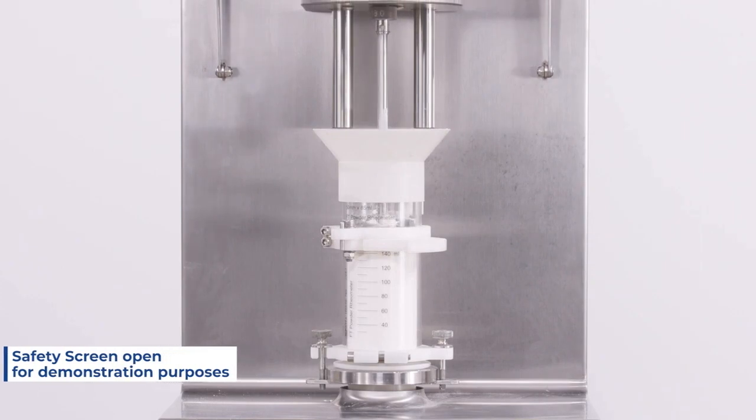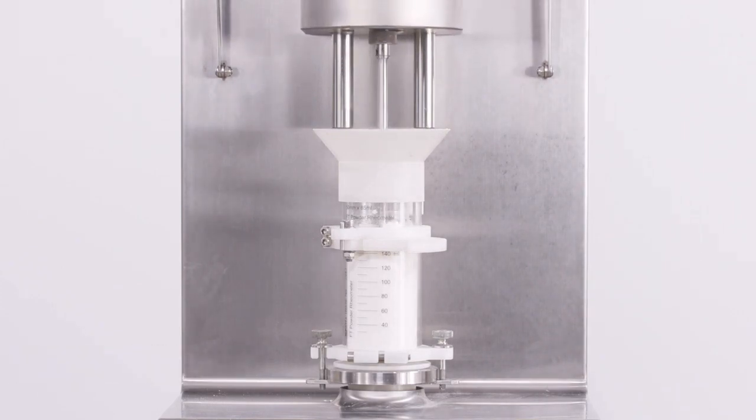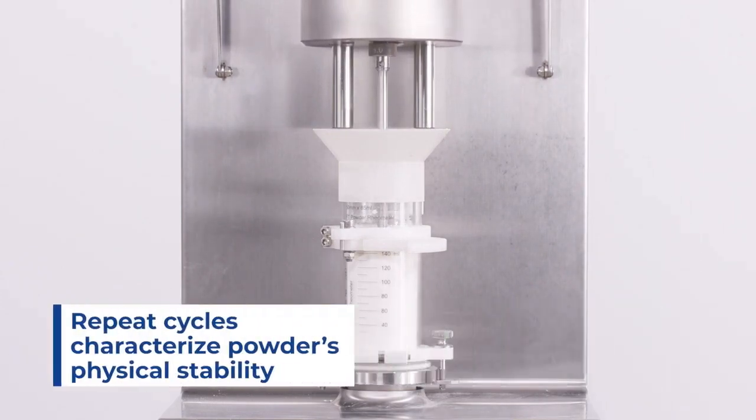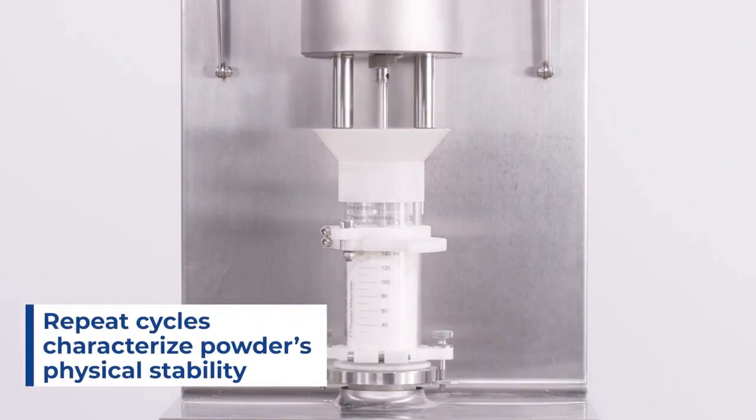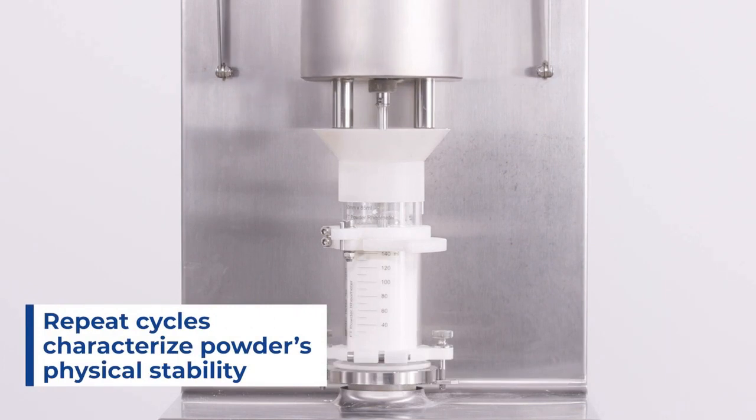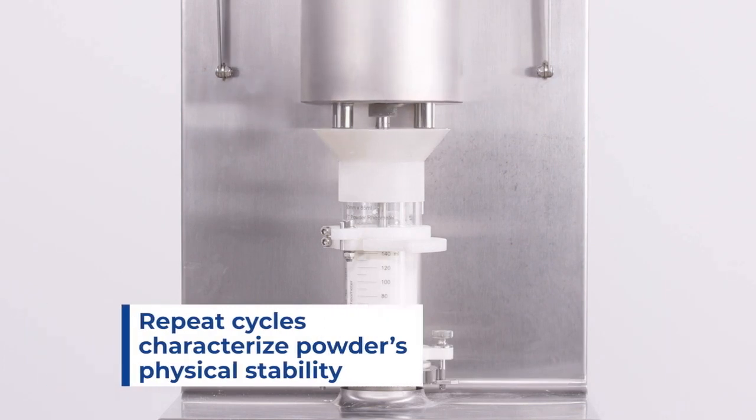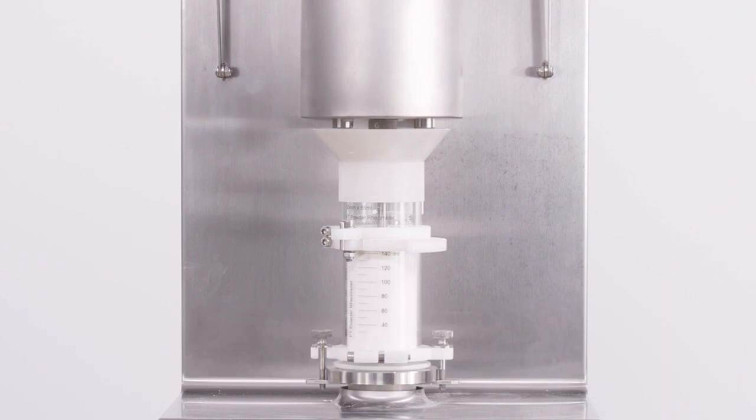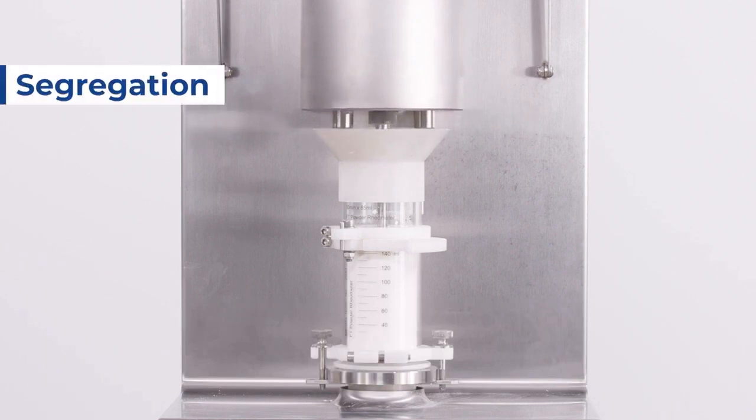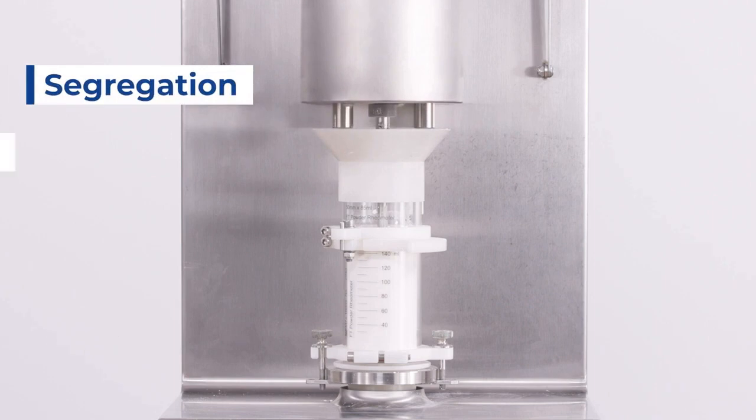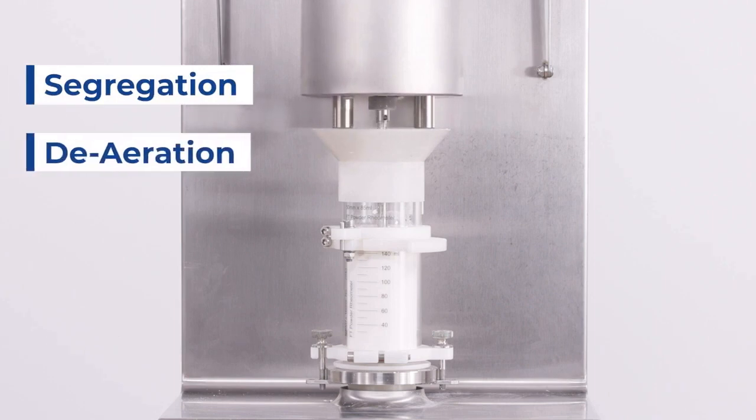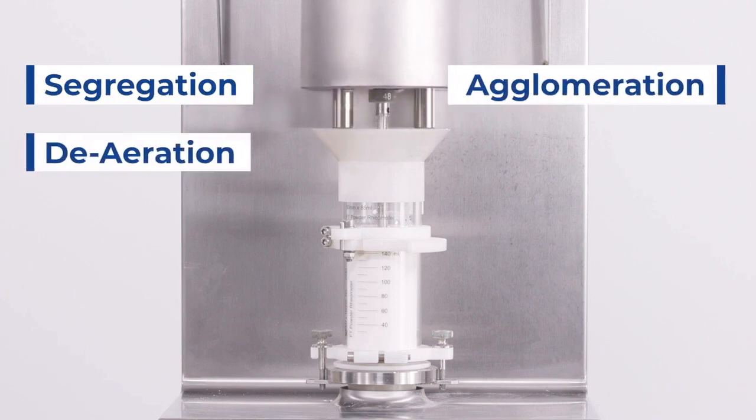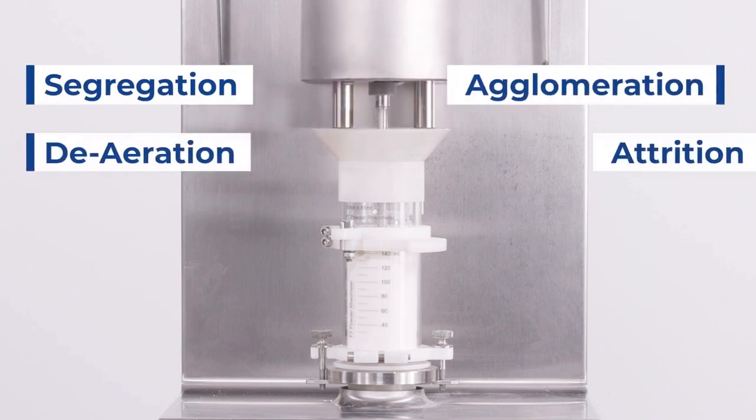By repeating multiple cycles of conditioning and testing the powder, we are going to characterize the powder's sensitivity to being tested in the FT4 and measure how its flow properties will change under those repeated test cycles. Doing so can help characterize certain powder processing phenomena such as segregation, de-aeration, agglomeration, or attrition.